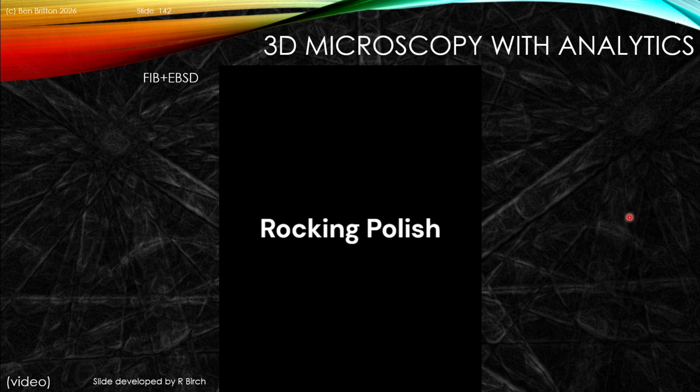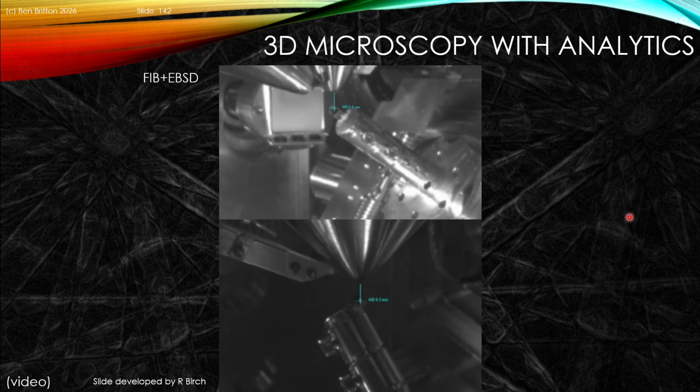We can also look at this, so that was biological systems. I can also show some work from Dr. Ruth Birch. This is looking at steel samples. And here we're now going to expand the approach to include some analytics. In this case, we're going to use electron backscatter diffraction. So we're going to use the Amber X system. We're going to do some rocking polish. We're going to do EBSD on each slice. And then we're going to effectively reconstruct the data for this structure.